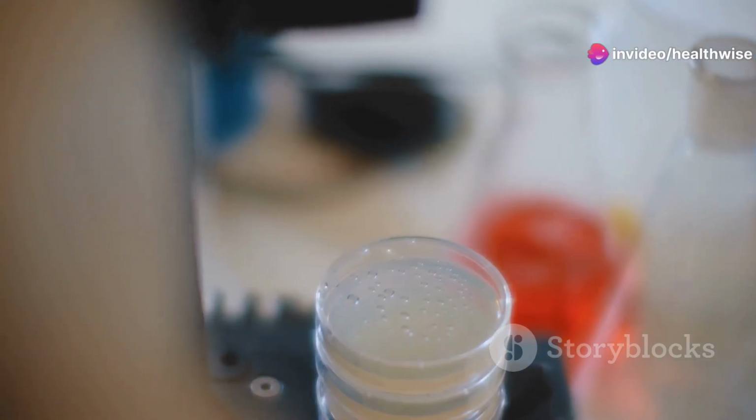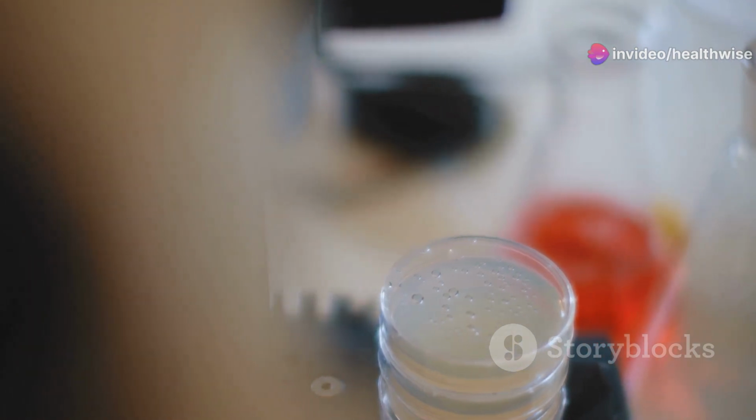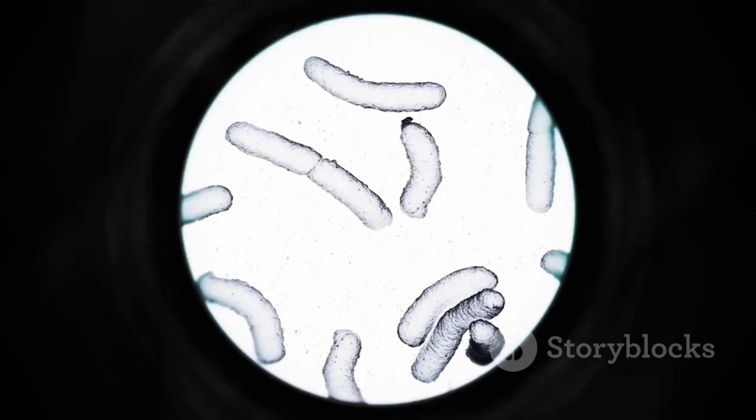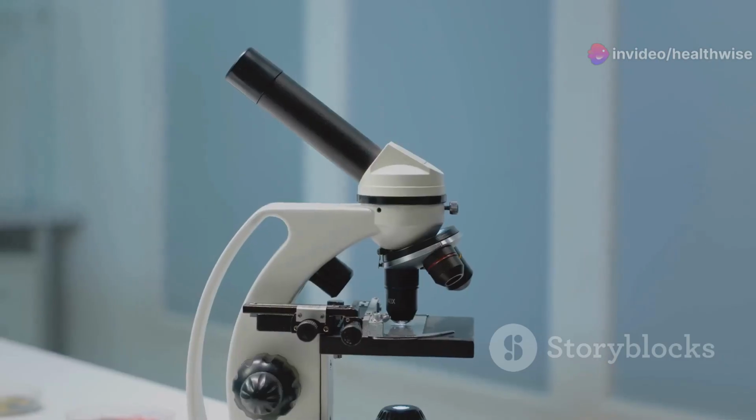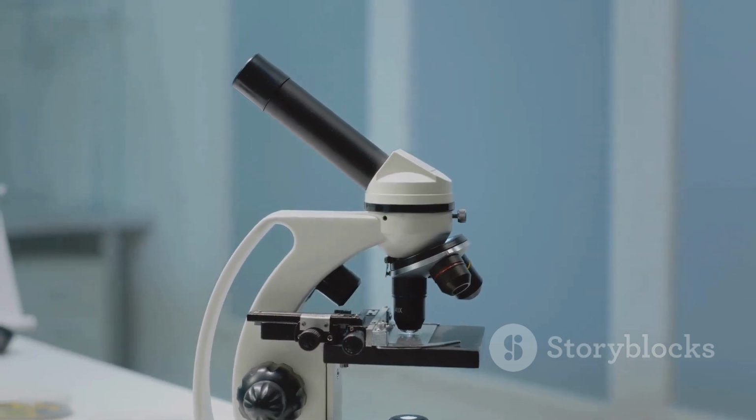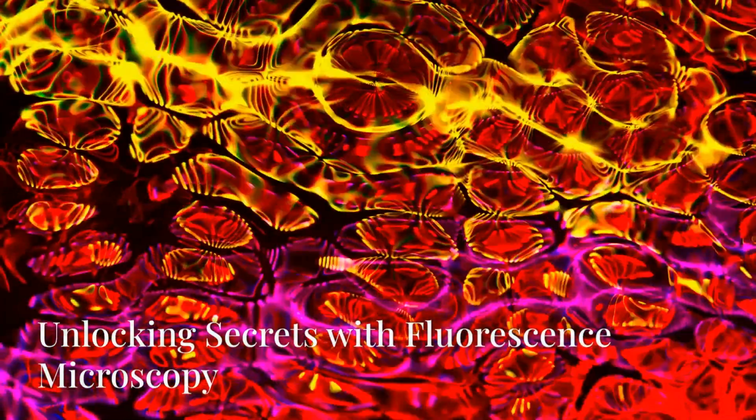This makes it ideal for observing living and unstained specimens. We can see delicate structures like bacterial flagella and internal organelles in action. The dark ground microscope is a powerful tool for studying living organisms. It allows us to observe their behavior and interactions in real time. This is crucial for fields like microbiology and cell biology.